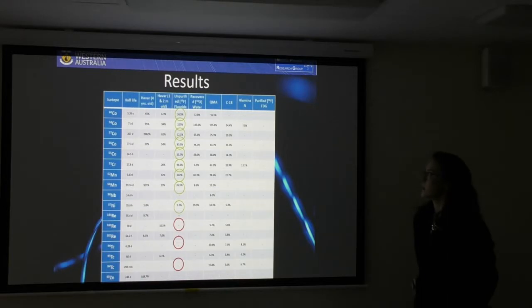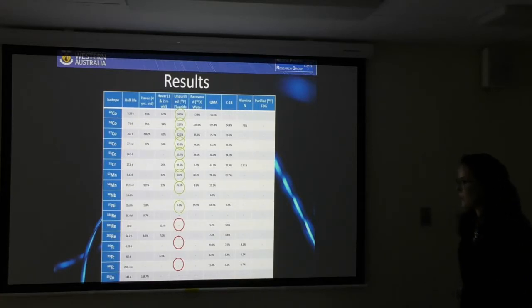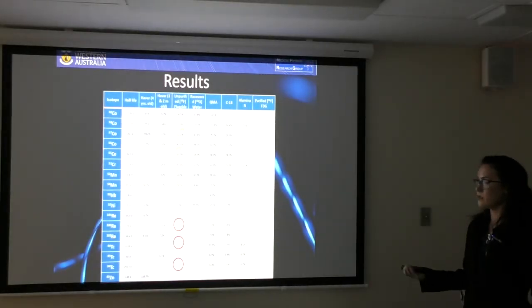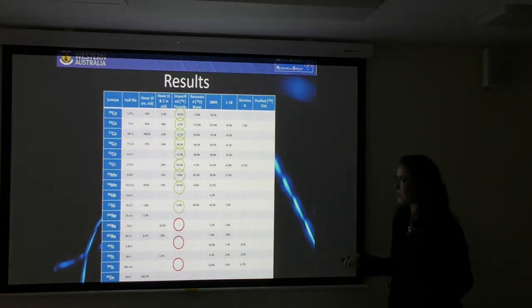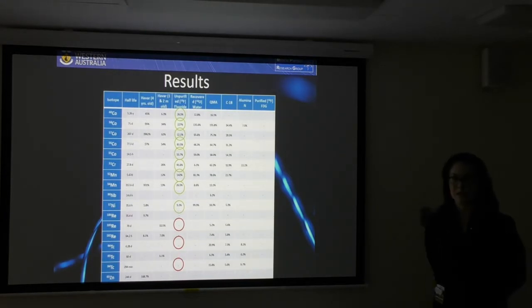For the unpurified fluoride, I did not find some elements that the other literature did. However, I just think this is because my sample was extremely radioactive and these energies were in the lower end where it was quite noisy. Although I was able to pick these up later on in the cartridges, so I would say that it's possible that these isotopes were actually in this sample, just weren't able to be seen due to noise.